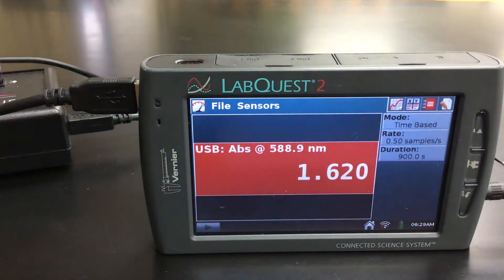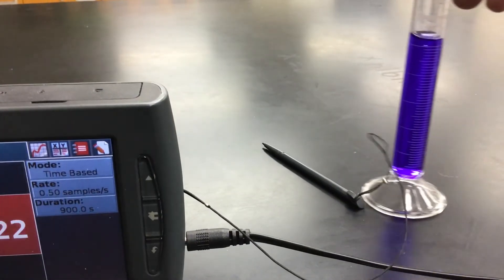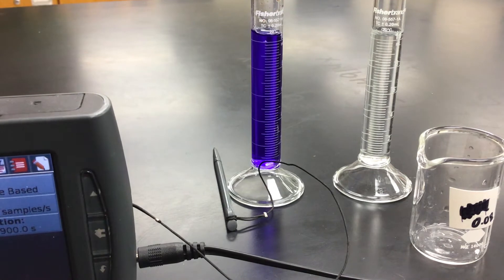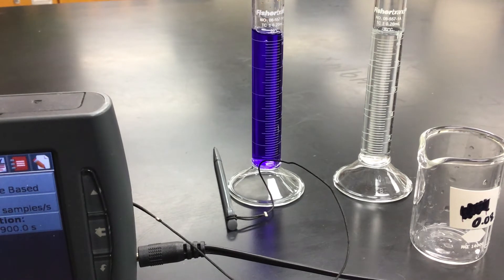Our solutions that we're going to mix together: we've got 10 milliliters of Crystal Violet and 10 milliliters of our sodium hydroxide. As you mix them together, we're going to start collecting data on our LabQuest. I'll explain why that is once we get everything mixed. I've got my cuvette handy to do that.